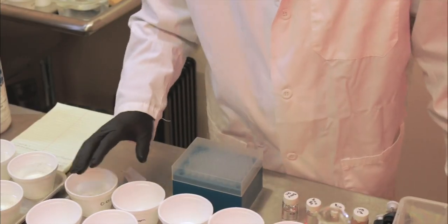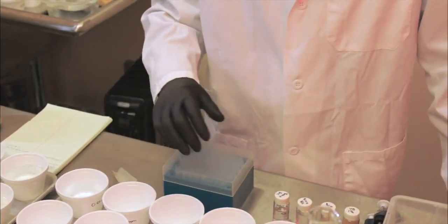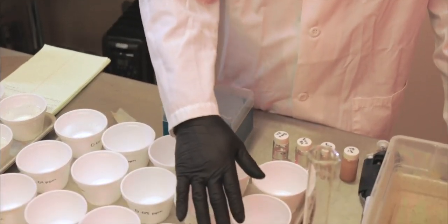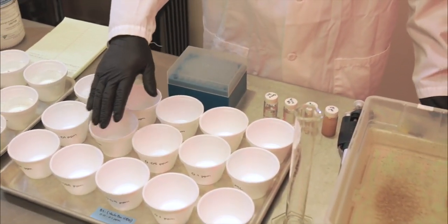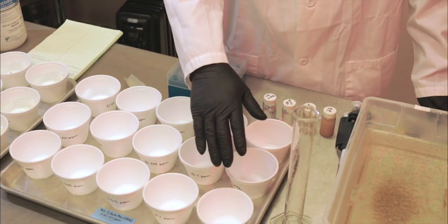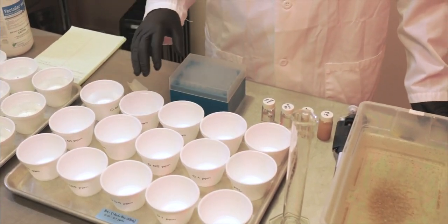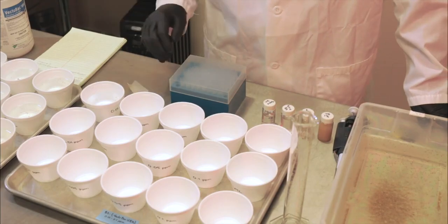So after that, you do all these cups for 4 concentrations from low to high, cover the range of 5 to 95% plus your untreated control. Then have 3 replications. So typically 15 cups will cover 1 bioassay.